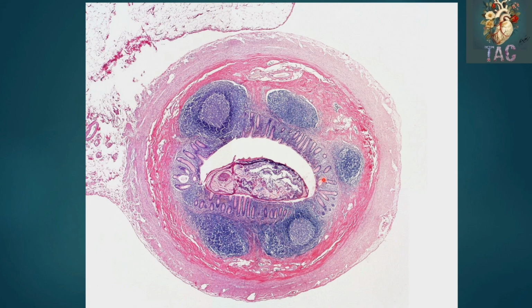Next you can see that the mucosa is arranged like that of the large intestine: no villi are present over here, the surface is smooth, and also no plicae are present. The intestinal glands are deep and they reach up to the muscularis mucosae. Another important point is a large number of lymphatic nodules are present, and large aggregates of lymphocytes give it the appearance of an organ of the lymphoid system.